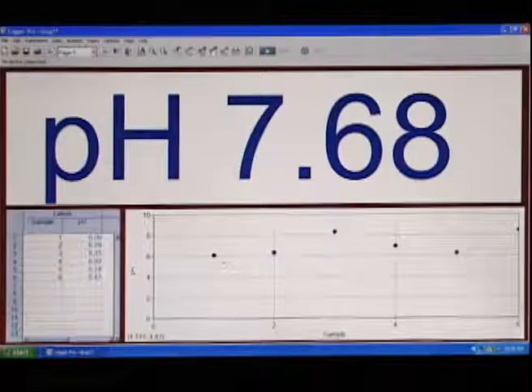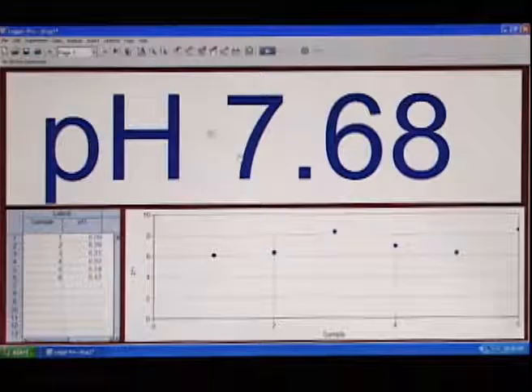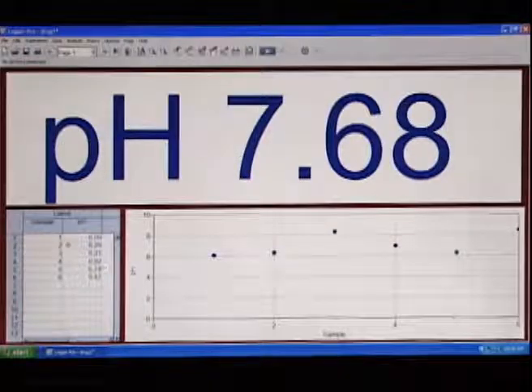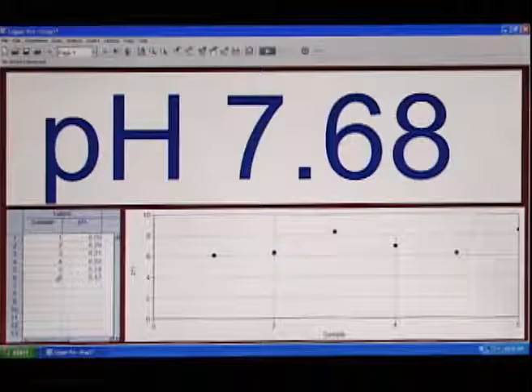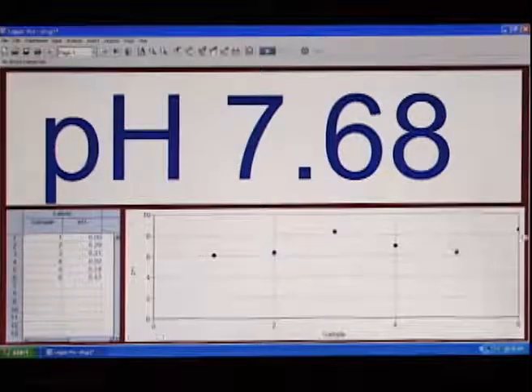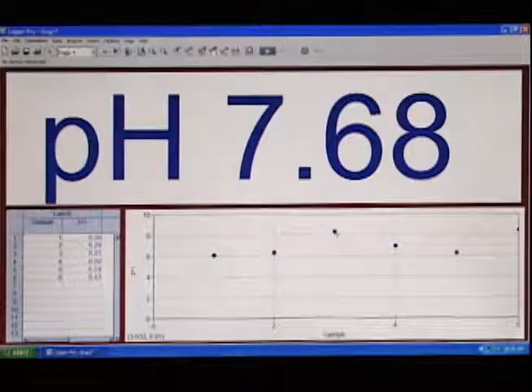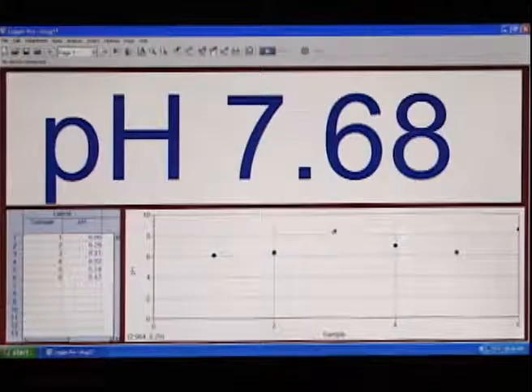Samples 1 through 5 are our known samples. Sample 6 is our unknown here. It's also recorded on the lower left-hand corner on the data table with the sample numbers 1 through 5 and 6, 6 being the unknown. Some students look at this and say, oh, at number 6, our unknown has to be 3 because they both are higher than any of the others. I caution you to warn students that one test alone does not determine an unknown, and the unknown obviously can be more than one thing.